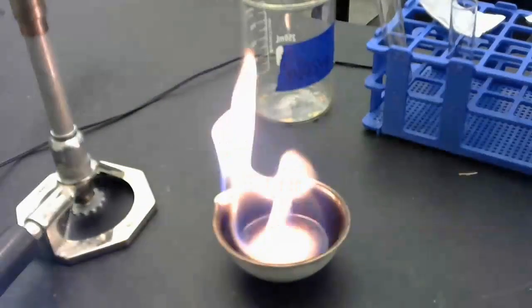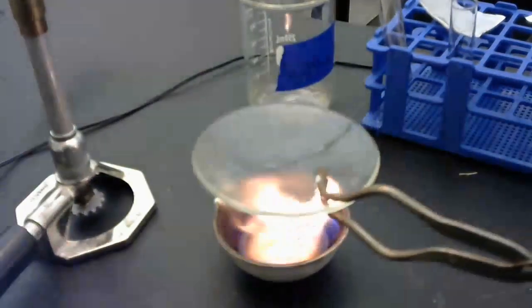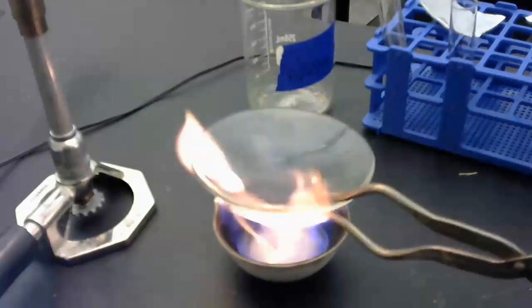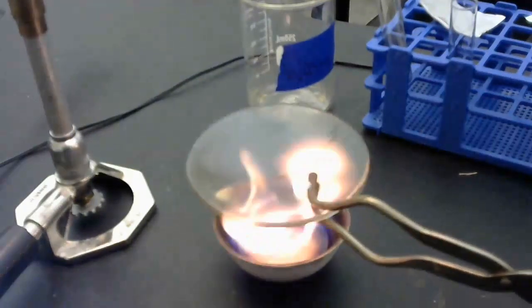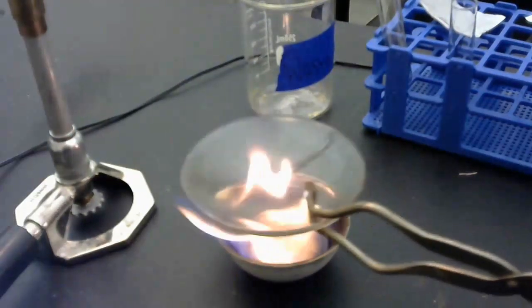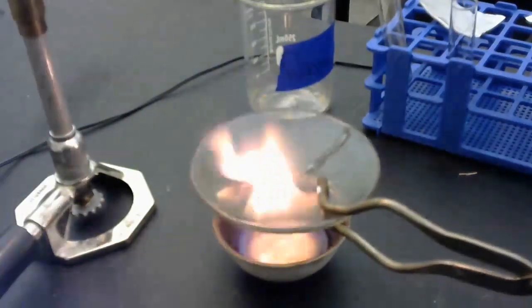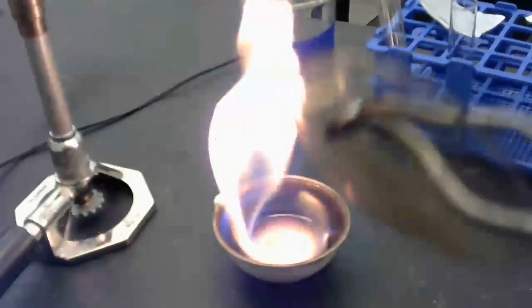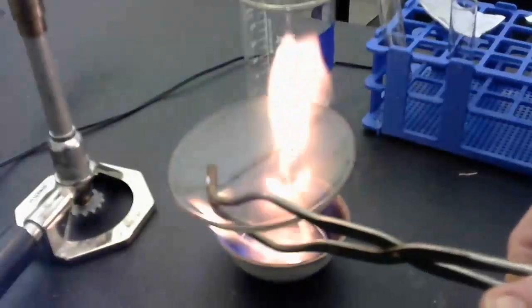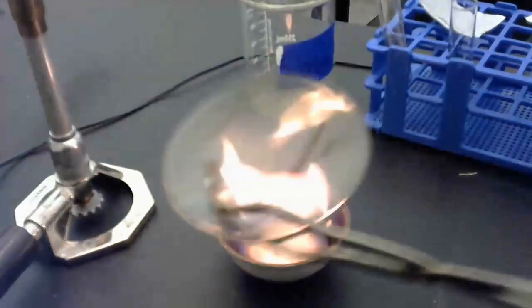And as that's burning, what I can also do is place a watch glass on top of it. And when I put the watch glass on top of it, what you can start to see at the very bottom of the watch glass is some condensation. And that's because when you have isopropyl alcohol or rubbing alcohol or any hydrocarbon reacting with the oxygen in the air, what ends up happening is you produce carbon dioxide and water. So at the very bottom of that watch glass, I am going to have a production of water.